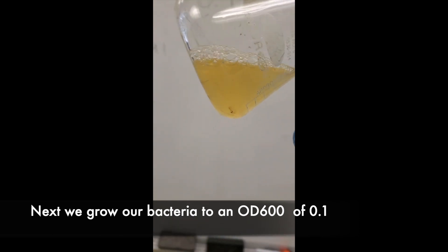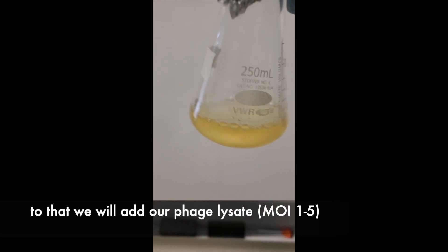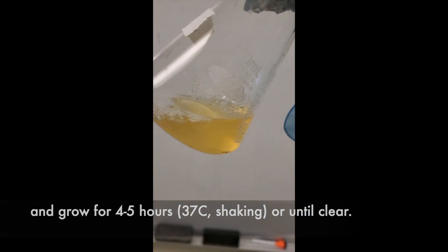Next, we grow our bacteria to an OD600 of 0.1. To that we're going to add our phage at an MOI of 1 to 5 and grow for 4 to 5 hours, or until clear.